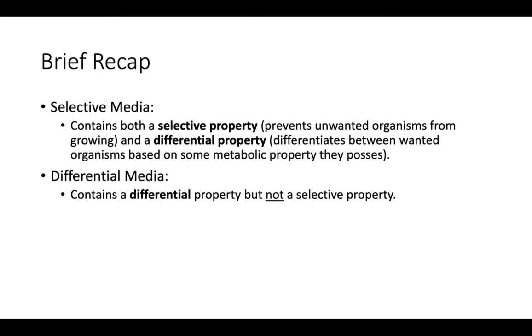So you didn't have any of that last class. Today you will have the only plate you're going to inoculate for differential media. This contains a differential property, but not a selective property. So anything can grow as long as it can use the nutrients present. We're not selecting against anything.